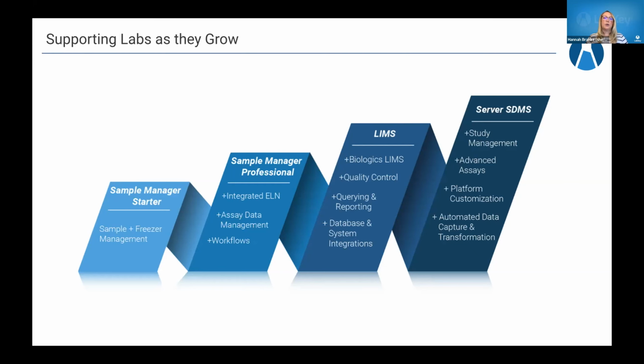As you start to grow into this digital space, having that integrated data connected ELN, allowing groups to capture their assay data as well as workflows, and then moving into a more advanced LIMS system, which can really provide more quality control, additional querying and reporting, and having some more integrations with other external tools that your lab might be using.